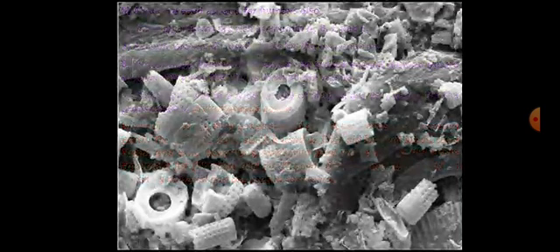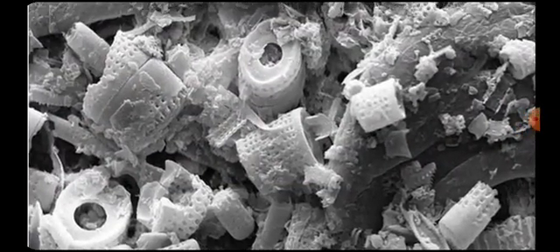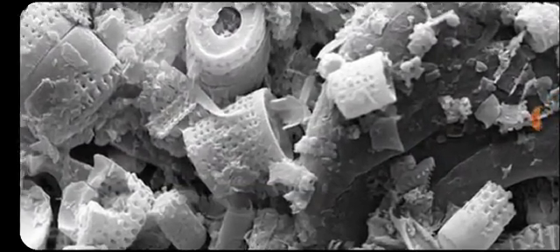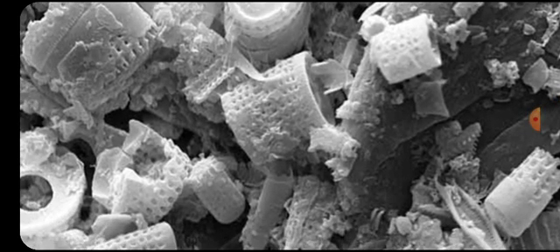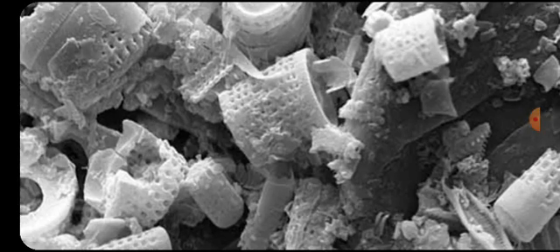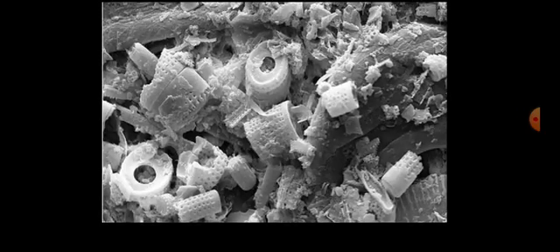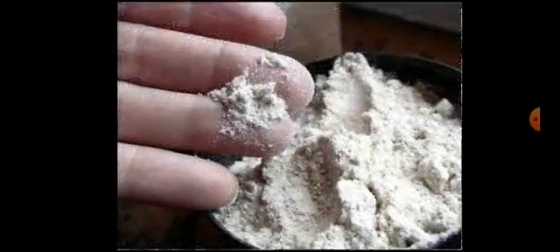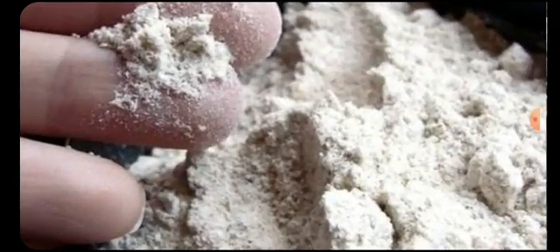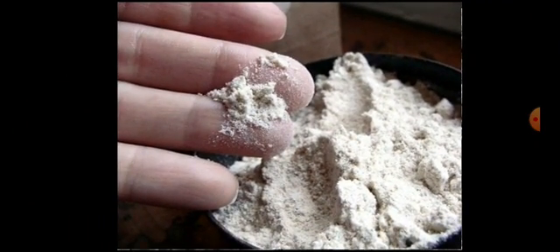So this is the electron microscopic photograph of diatoms. You can see carefully the skeleton of the diatom, and it contains small holes or pores, and because of this the preparation, which is called diatomaceous earth, is very useful as a filter aid and is used in filtration processes.